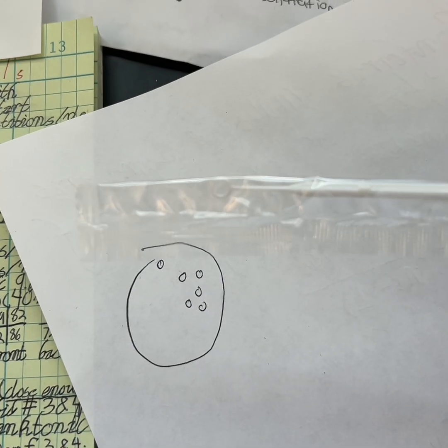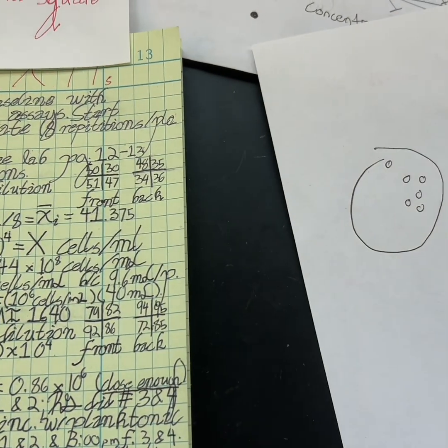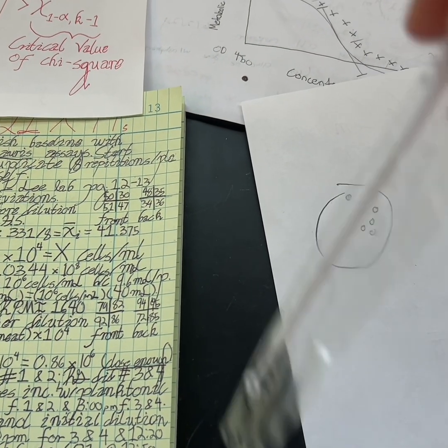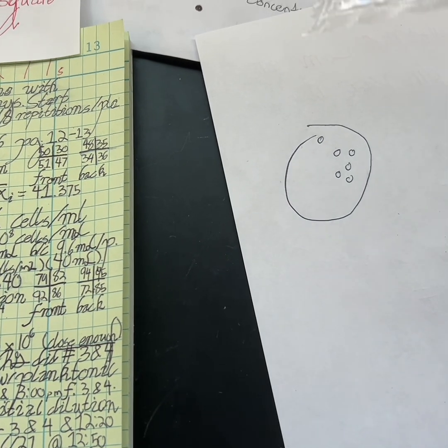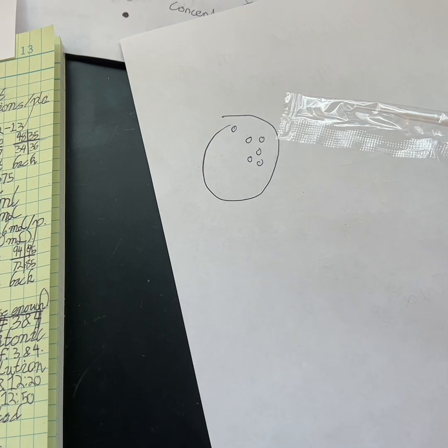So you'll take that and then you will simply put it into a broth culture, mix it around. It'll be a 50 milliliter conical with maybe about 10 milliliters of fluid. And then you'll keep that shaking at 37 degrees Celsius under CO2.